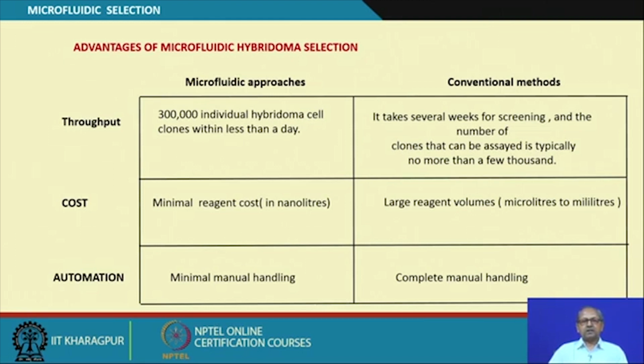Large scale screening could be done in a very short period of time, which I am not discussing here. But anyway, microfluidic technology has a better impact where screening and selection processes are preferred rather than normal macro scale processes.